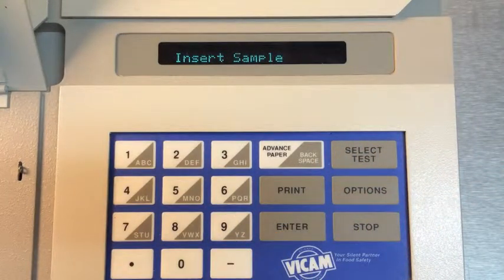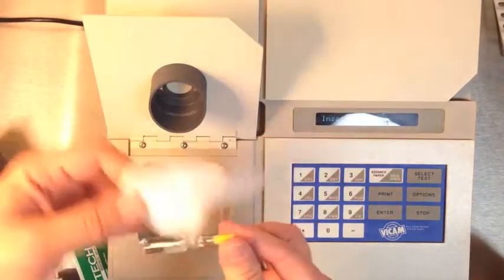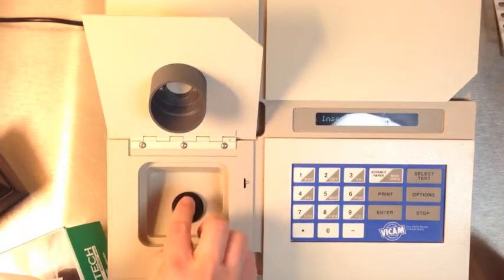Insert the yellow vial into the machine. After 60 seconds, note the results. The result must fall into the range noted in the current procedures manual to confirm calibration.